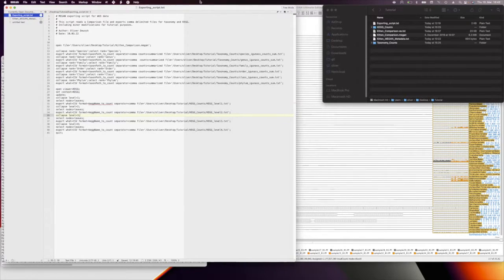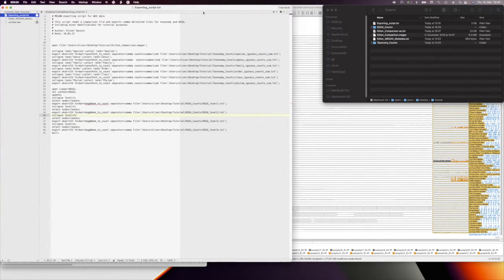And this is not just because computer scientists like to be lazy; they are lazy because they like reproducibility. So when I run this script, every time I can make sure that I get the exact same output.